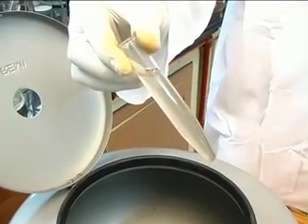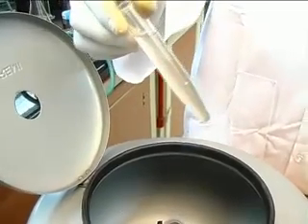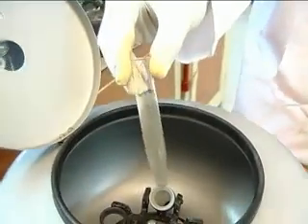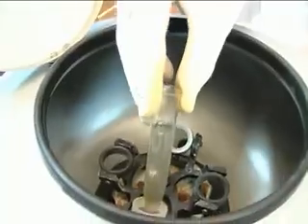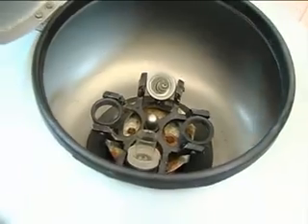Notice that the solution, which is somewhat unclear — that is, turbid — is now added to the tube and placed in the centrifuge holder. The lid is closed and the switch is turned on.